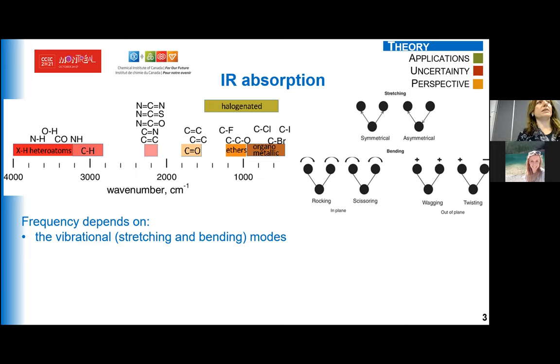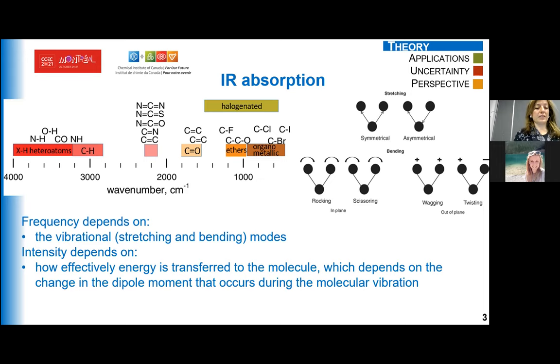The only thing that we have to know is that if the bond doesn't have a dipole moment, we are not going to get any vibration mode, so we are not going to detect it. For example, diatomic gases like hydrogen or oxygen are not able to give a spectrum.